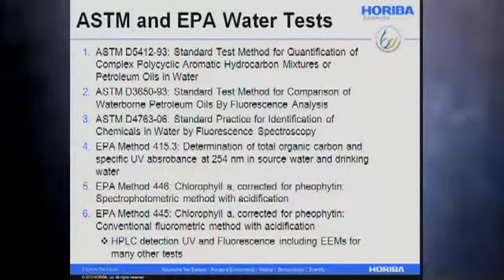There's a very interesting standard practice for identifying dozens of chemicals in water by fluorescence spectroscopy that's under revision. There's also the EPA method for total organic carbon and specific UV absorption, again being of interest in terms of the added advantage of the new technology, and the chlorophyll methods, as I mentioned before.